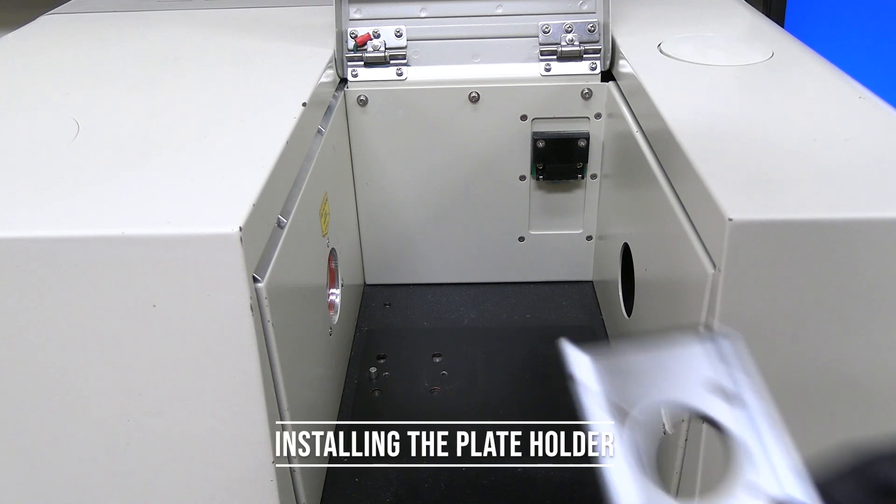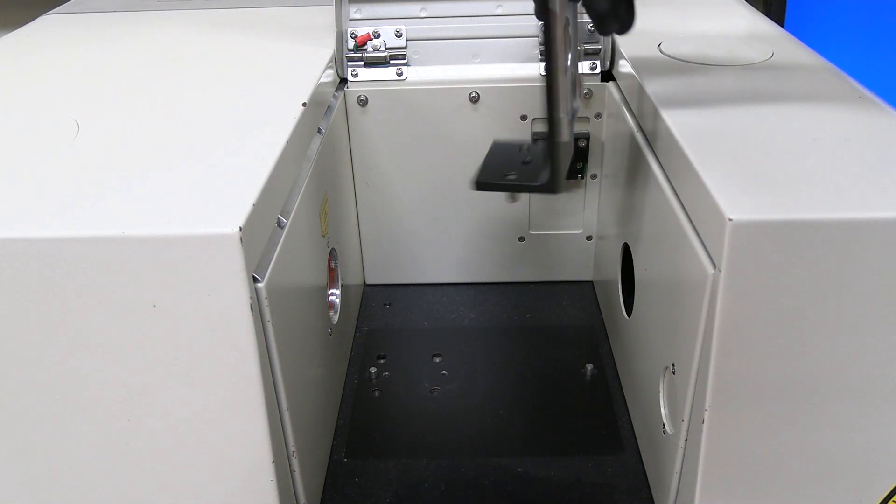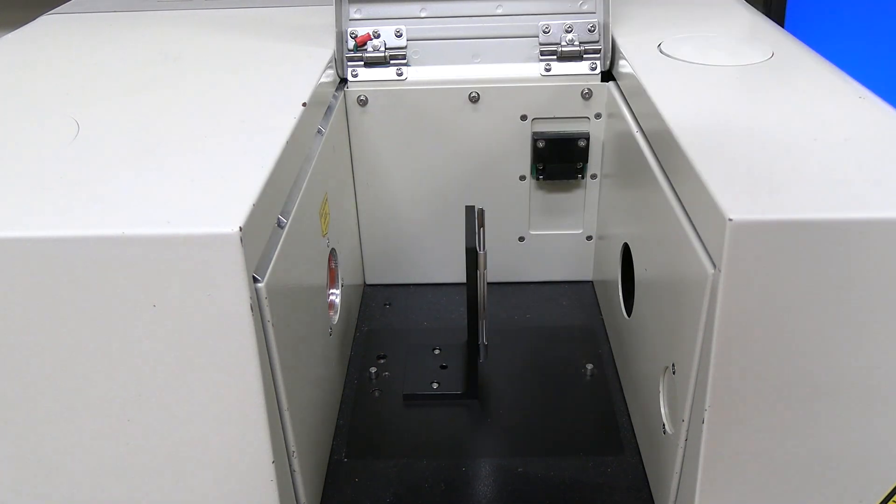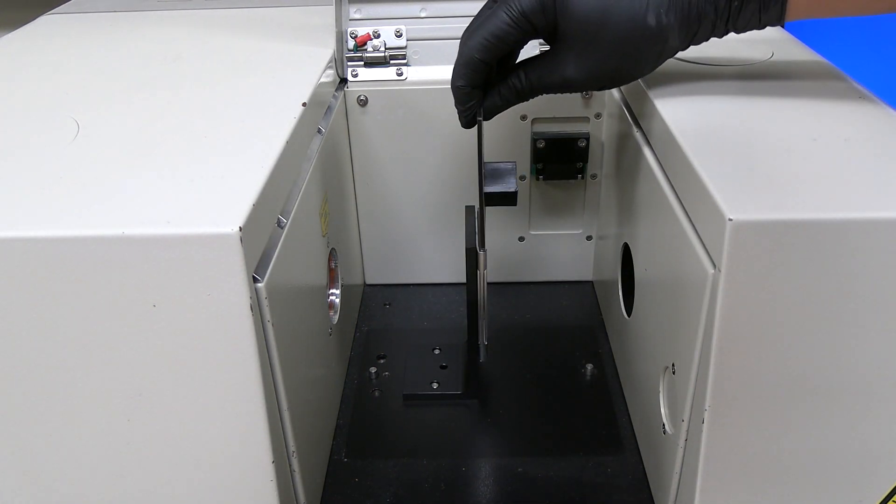Install the plate holder. Install the plate holder mount into the sample chamber. There are sets of holes for the mount pegs. Insert the plastic plate holder into the mount.